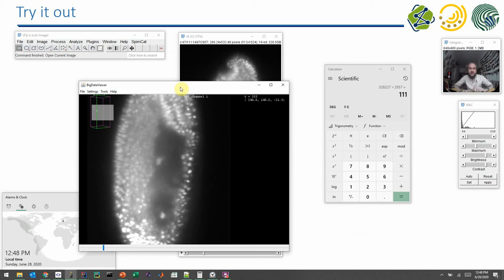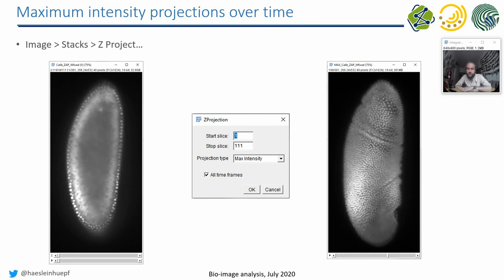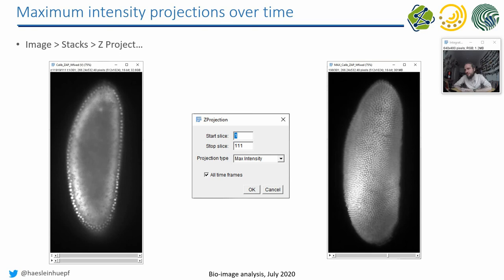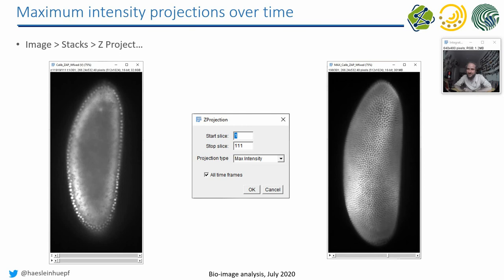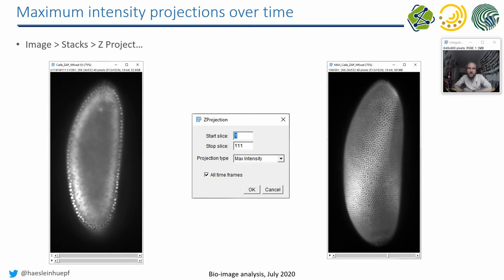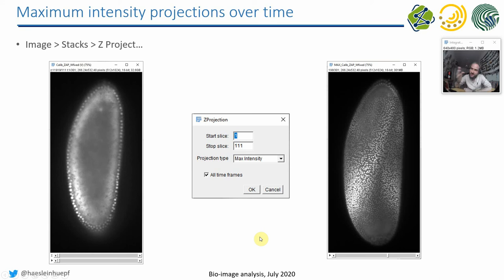We did this last week already: maximum projection. If you loaded such a dataset and you want to see from a certain perspective how the embryo is developing, you can do maximum projections. If you do this with a virtual stack, it may take some time until these datasets are generated. But you can just do that with the same menu as shown last week. Use ImageStackZ project and process all frames. Then you get a video like this where you can have a first look at how the embryo is developing.